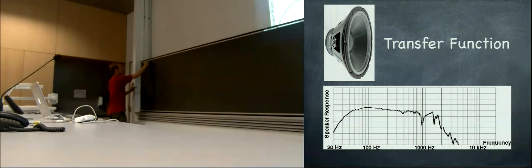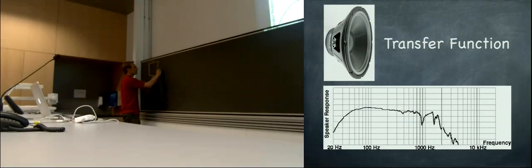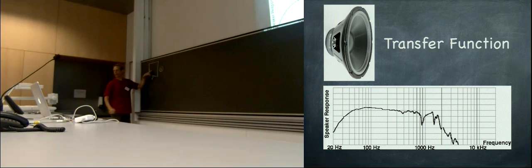So what I had was, if you have an image, and this is the image F, and this is our atomic structure. So let's say we have one atom here and one atom there.